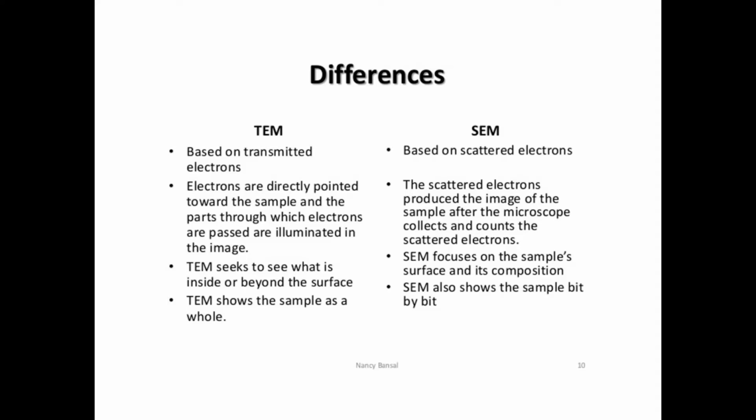Now the difference between SEM and TEM, since most of the time you get confused between them. First, SEM is for bulk, thick samples, TEM is for thin ones. Transmission means the electrons go from here to there. In TEM, the electron beam produced can pass through the sample, so the sample must be very thin and very small.